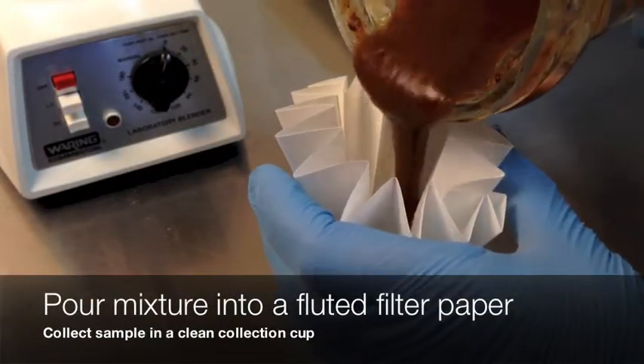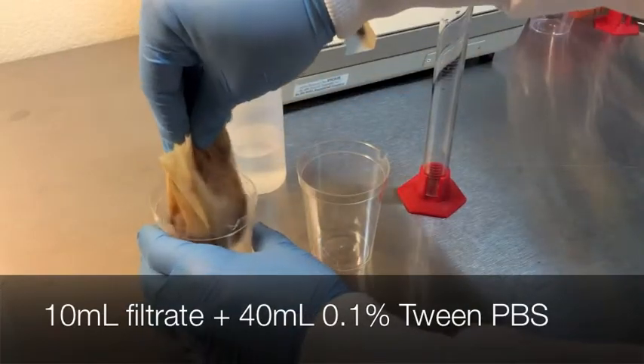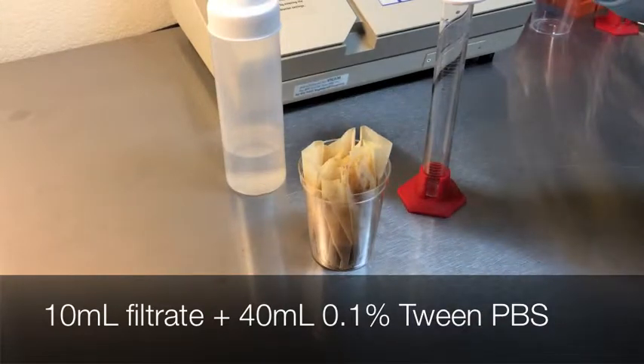Pour the mixture into a fluted filter paper and collect the filtrate in a clean collection cup. Combine 10 milliliters of the filtrate with 40 milliliters of the tween solution. Mix well by passing back and forth into a new clean cup three times.